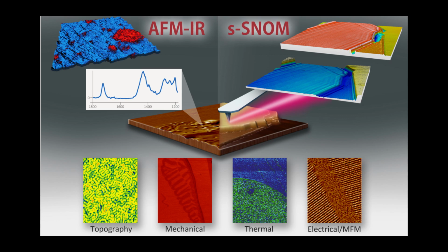There are a number of questions about how IR can determine the crystallinity of a material. This is not true of all polymers, but for certain polymers, whether a material is more or less crystalline can impact the strength of absorption bands related to that specific bond of the molecule.